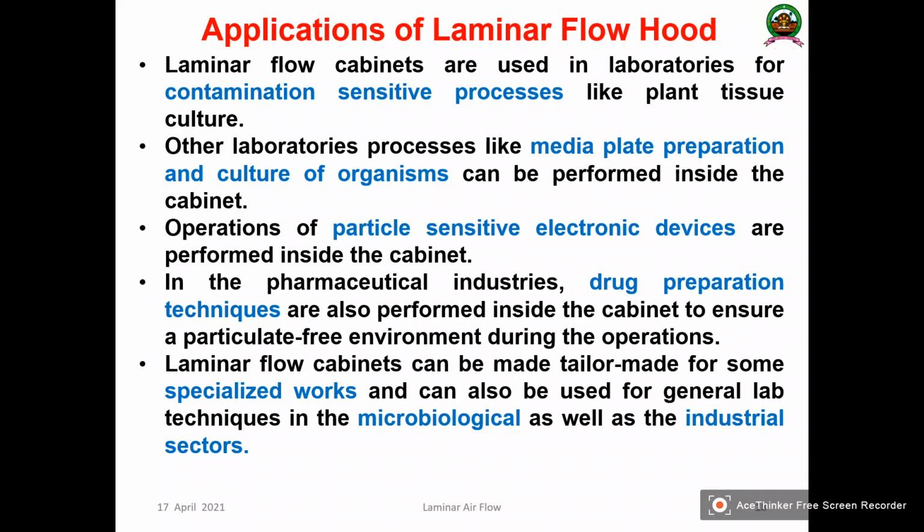Then what are the major applications of the laminar airflow hood? Laminar flow cabinets are used in laboratories for contamination-sensitive processes like plant tissue culture. This is very important, and we can use it specifically in plant tissue culture because that is one of the important sensitive steps, like culturing of the plant, explant and callus. Other laboratory procedures like media preparation, media plating, culture inoculations, whatever microbiology work we are doing on the workbench, can be done in the laminar airflow hood.